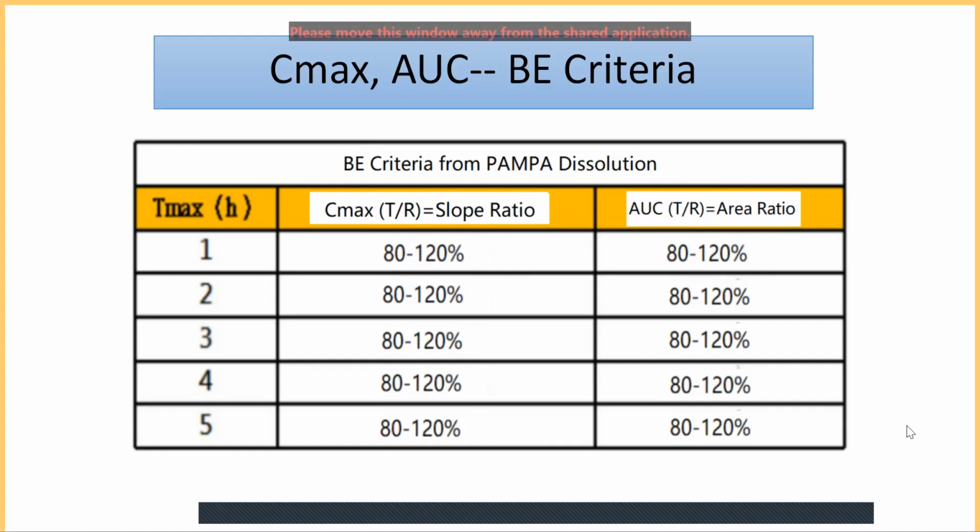Okay, if your test is very close to 100%, that means your test drug or formulation is pretty good, right?